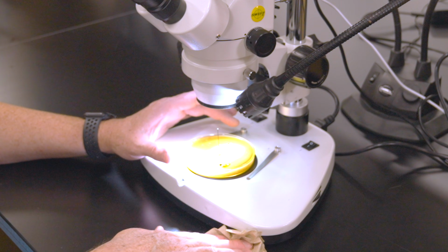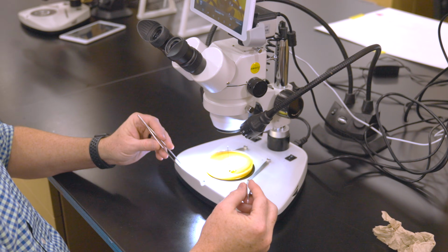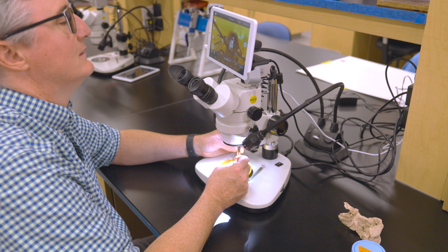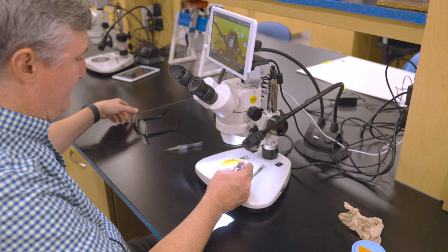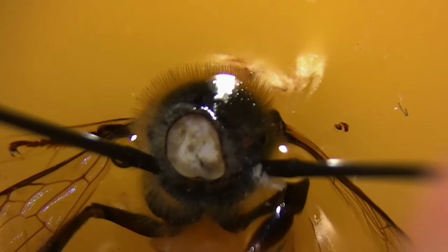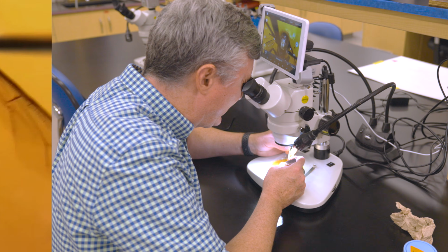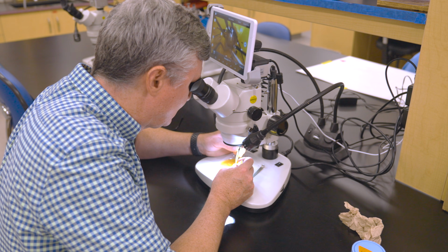Some people will remove the head and abdomen first and then pin the bee. In this case, the thorax is pinned using a pin on either side, which pins it belly up towards you. And again, you can use 2 individual pins, or you can use that pencil cheat I told you where you stick 2 pins into the eraser of a pencil, and now you've got an easier handle to use as you pin that thorax down.